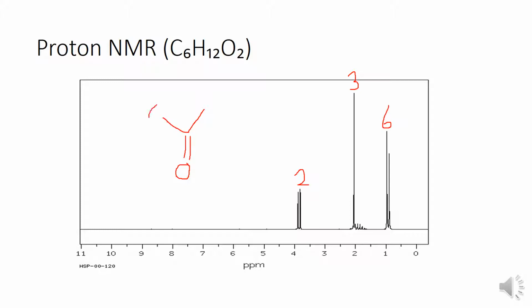So, moving on from that, we do know that we have a singlet, which we'll show you where. We have a singlet here, meaning we more than likely have a CH3 functional group, a methyl functional group. So we're going to add on the rest of our carbons now.